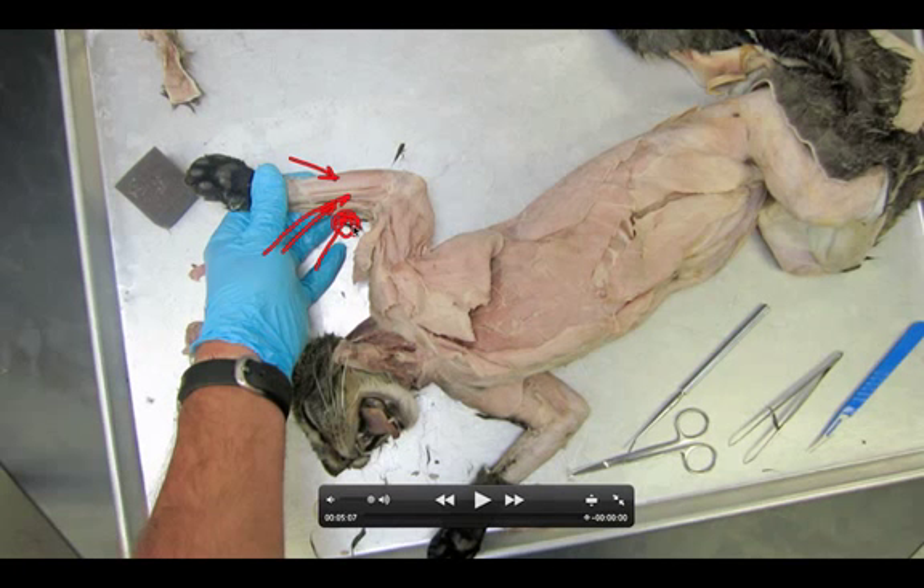The extensor carpi radialis is a lateral muscle we've already seen on the other side. Up here on the arm we're also going to find the epitrochlearis and we're going to see the biceps brachii. So those are the muscles we're going to look at today.